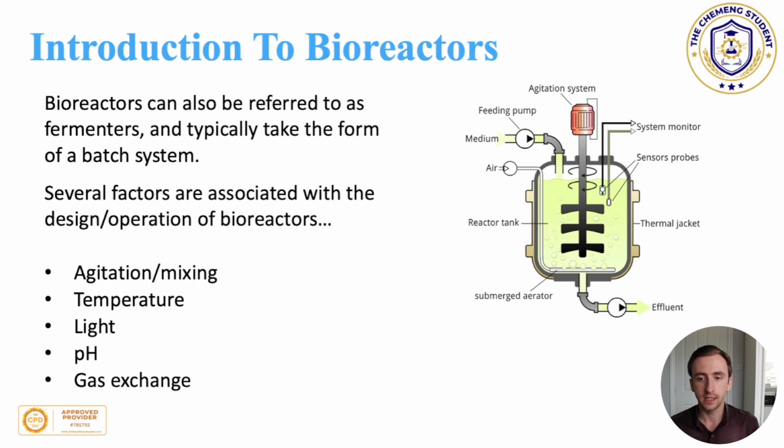This is something that I do as part of my research: I look at high value biochemical compounds from a wide range of microalgae species, and the design of reactors and the manipulation of these variables is something that I do quite frequently. So certainly in the context of bioreactor design, these things, especially the agitation and the temperature, are very, very important.